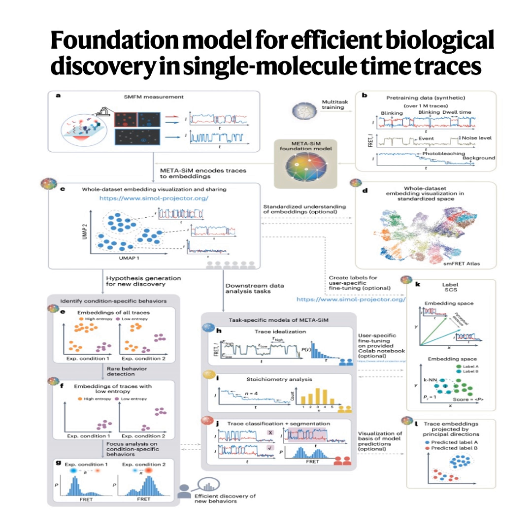Right, synthetic. And that's actually the secret sauce here. These weren't just random squiggles. They were carefully designed simulations. How so? They were built to mimic a huge range of possible SMFM scenarios. One color, two color experiments, different speeds of transitions, different numbers of states the molecule could be in, varying levels of signal to noise. Basically, trying to cover the whole universe of possible SMFM data. Okay, but why synthetic? Why not just use 1 million real traces? Wouldn't that be better? Because of one critical thing.